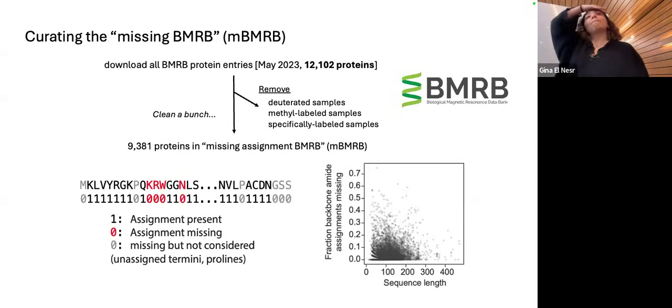Yeah. That's my question. I haven't done NMR, but the larger proteins are going to tumble slower. So are you losing any? Yes. We're just assuming very broadly that if it's missing, we make that assumption, and we hope that the ML will wash that away. The pre-training will wash that away.